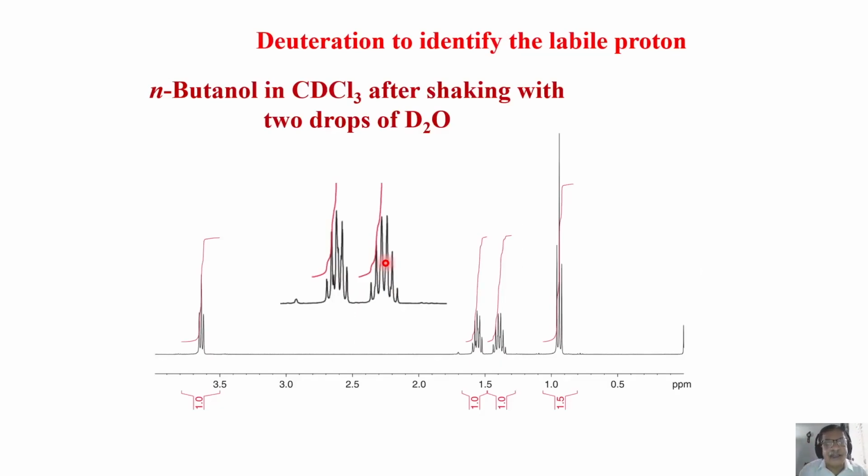If you start analyzing a large number of spectra, we can do, right? So this is a reasonably small molecule, small complex molecules I have taken. Go to bigger molecules. Real experts go and start analyzing the spectra of proteins, very big macromolecules also. That comes with a bit of experience. Once you start doing this work, it's a matter of time. In a few months, you will become an expert at analyzing even complex molecules.